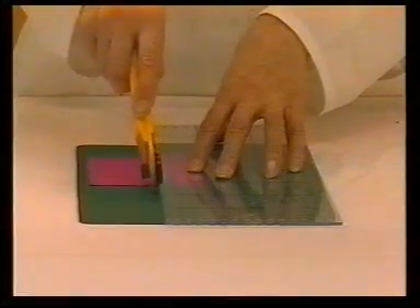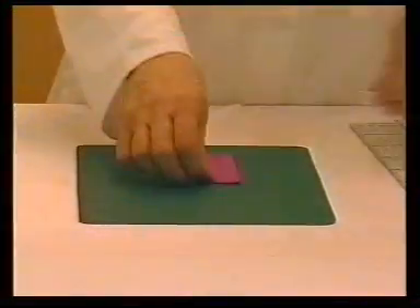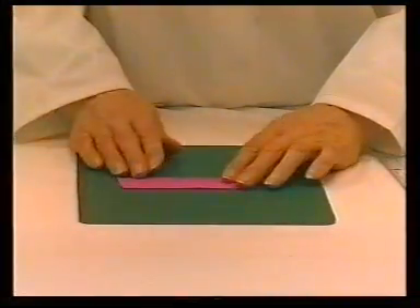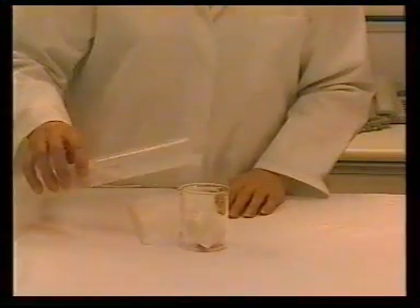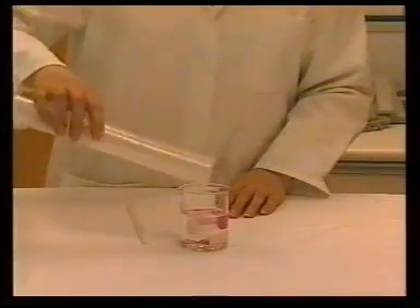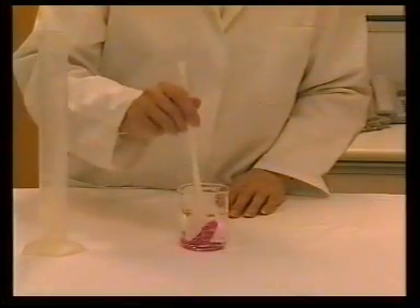A test specimen 100 by 40 mm is cut from the sample provided and attached to a similar sized multi-fibre strip. The composite specimen is wet out in a beaker with a specified amount of the relevant solution at room temperature. The specimens must be thoroughly wet out and any air bubbles removed.